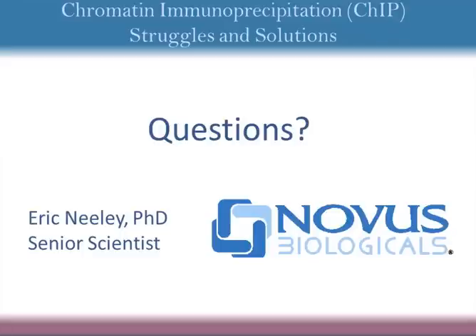Sure. Okay, on to another topic. From Zoe: for the immunoprecipitation, is it better to use the antibody against your protein of interest, or can you also use antibodies against fusion tags such as His tags? That's a good question. You can use the tags.